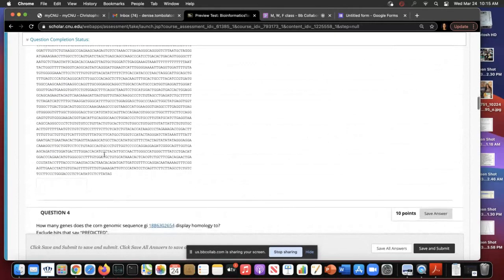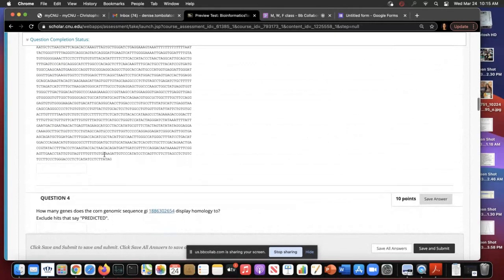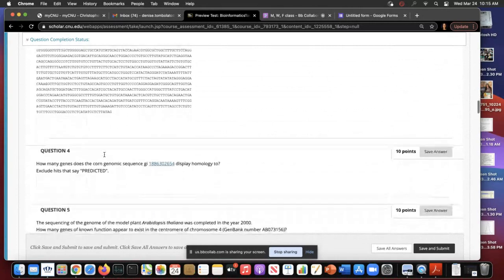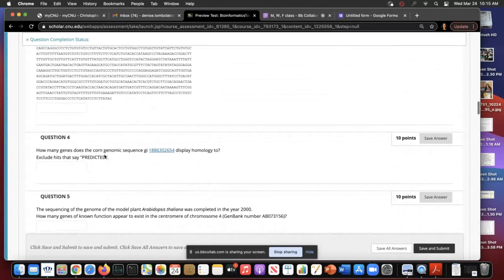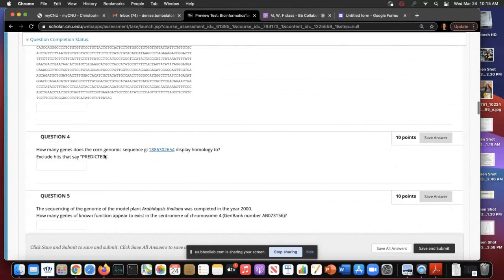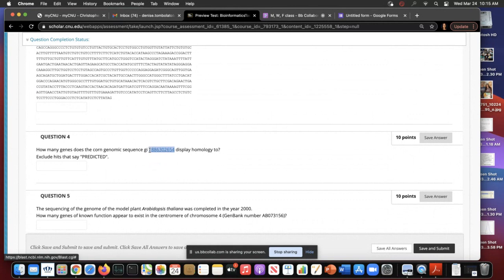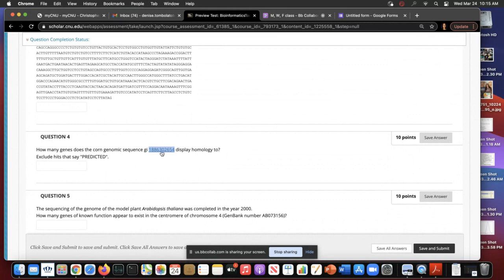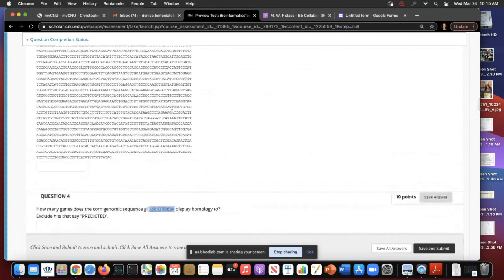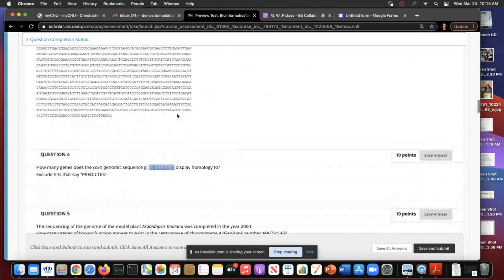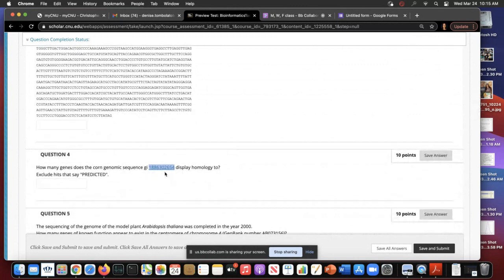I want to show you a sequence where there's genomic sequence, so there will be some sequences that are genes and some that are not genes. The shortcut is we're just going to copy this number because BLAST accepts the GI number, that's the gene identifier number. The long way would be you click on that and copy the sequence. The short way is, I have the GI number, I can just put that there.